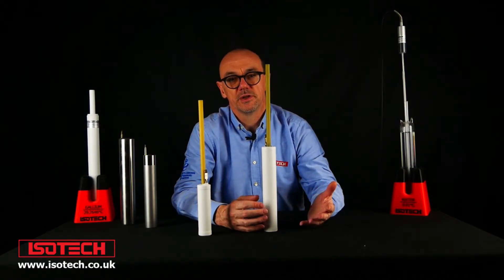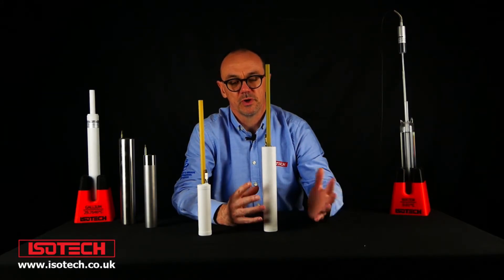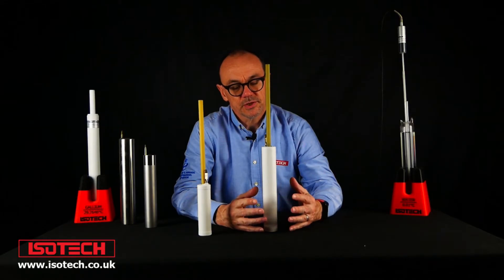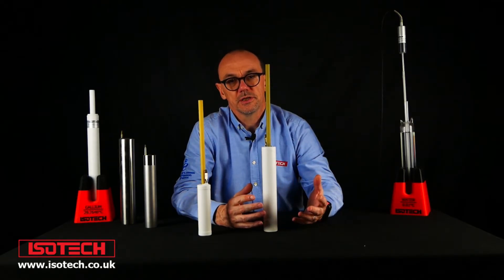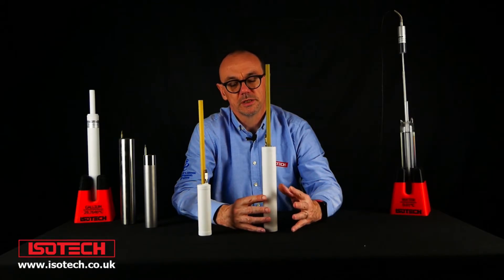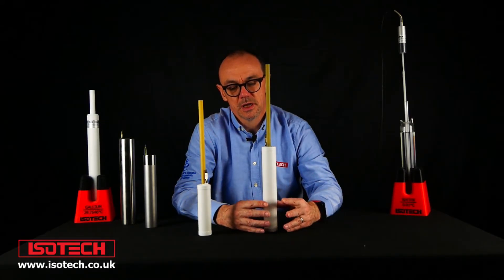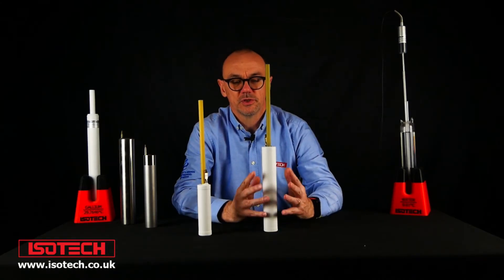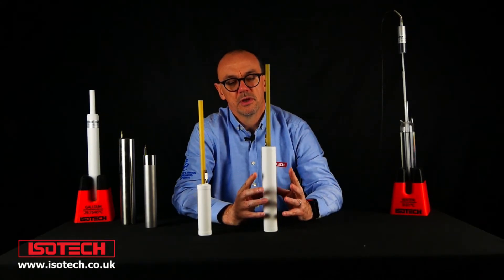Mercury has been replaced in clinical thermometers, for example, and people would really like to find a safer alternative than having to use mercury as a fixed-point cell. That said, until scientists are able to do research and introduce a new point, people will still require mercury triple points to calibrate SPRTs.